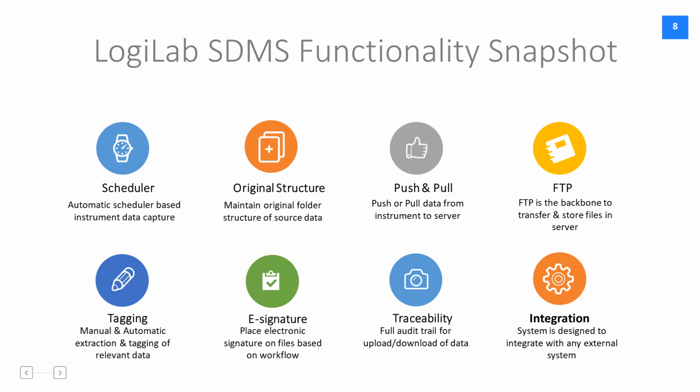LogiLab SDMS has full traceability. There is an audit trail module which records each and every event happening with respect to upload of data, download of data, restoring of data. LogiLab SDMS has a full-fledged audit trail which is compliant to 21 CFR Part 11.